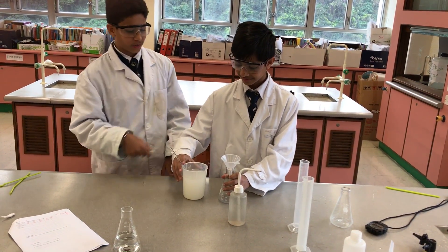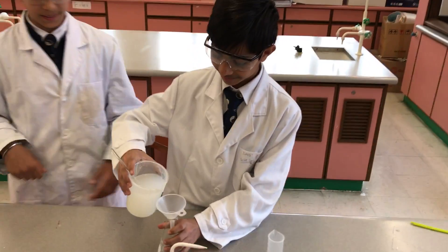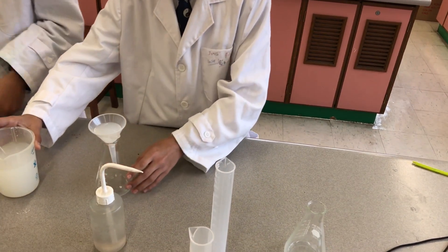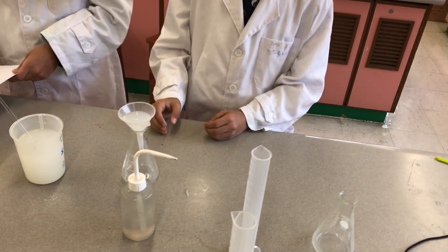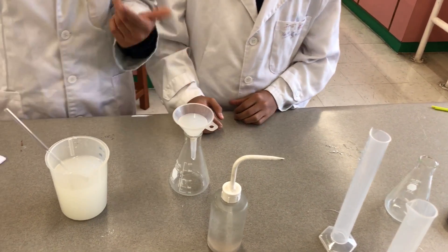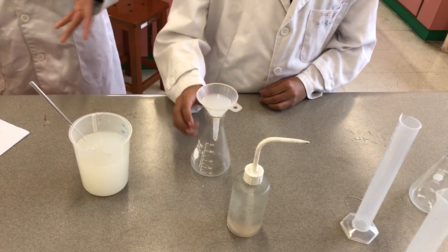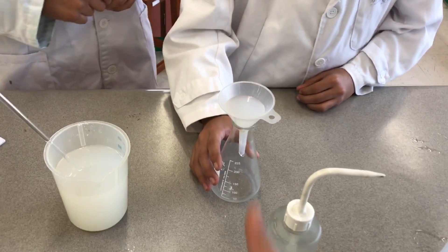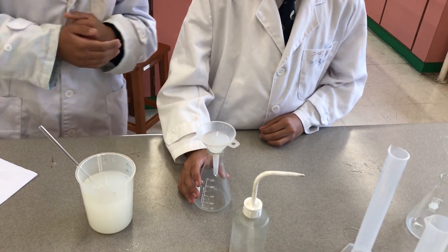So here we have limewater, and now we're going to filter it. As you can see, it takes a lot of time to filter, so we have to be patient. This method is better than the traditional one because we use cotton.